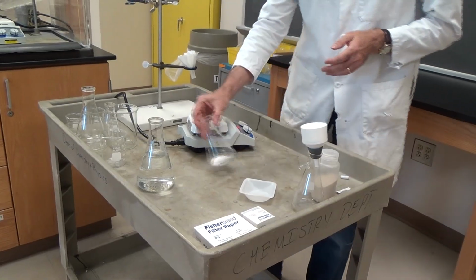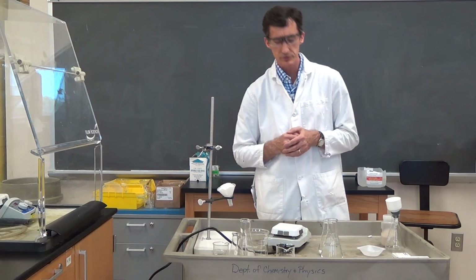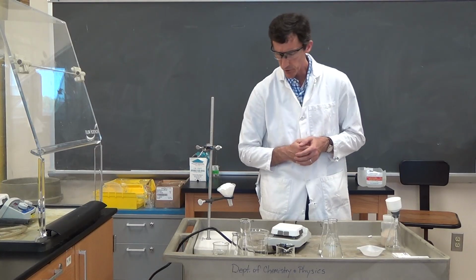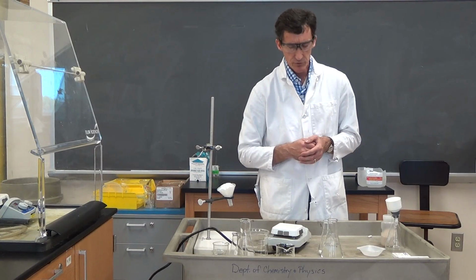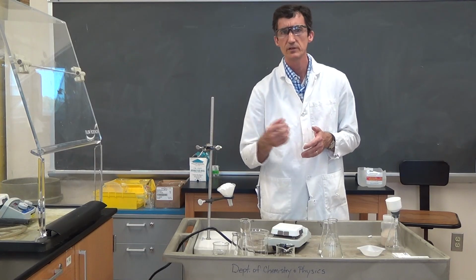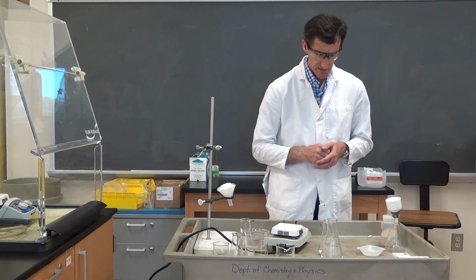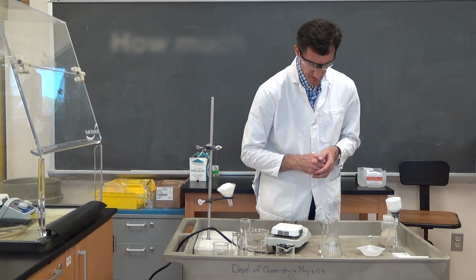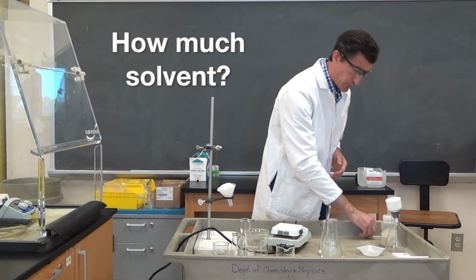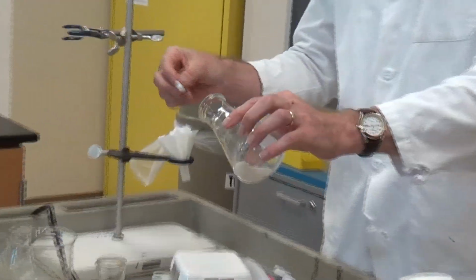Okay, we've got our compound in our E-flask. There's a variety of solvents we can use to recrystallize. As I mentioned, we're going to use water. In lab, typically you'll use maybe an alcohol, such as methanol or isopropanol, or maybe something like nonpolar hexane, cyclohexane. There are a variety of solvents. First question is how much solvent. By the way, we always want to use a stir bar. We're going to be heating, we want to use a stir bar. Stir bar added.